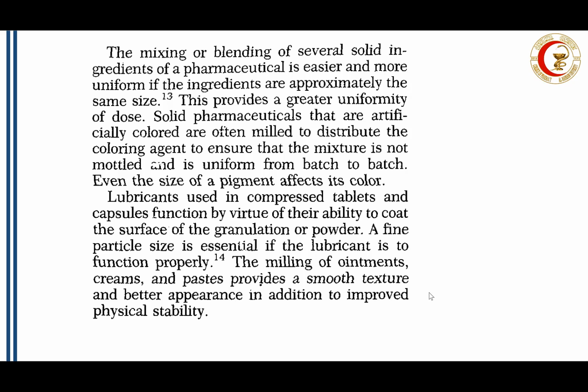This can be overcome by simply milling the coloring material with the formula to a similar particle size, and this will also aid in mixing during the milling procedure. This is also the same for the active pharmaceutical ingredient with excipients, to ensure uniformity of the dosage form and uniformity from batch to batch.